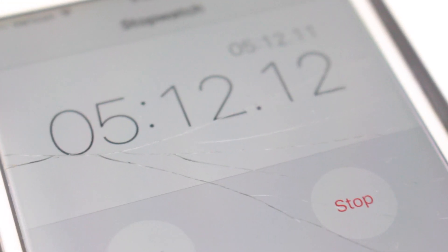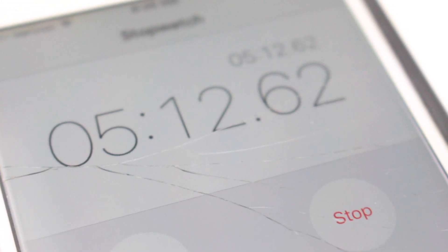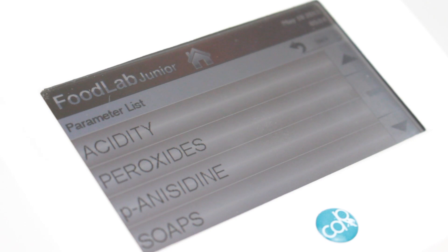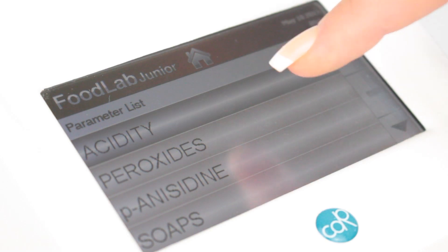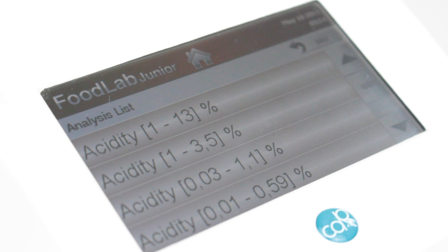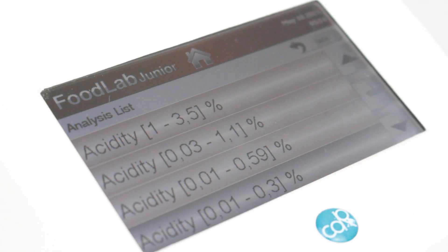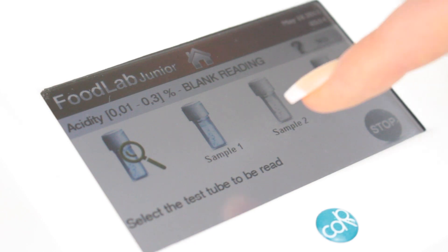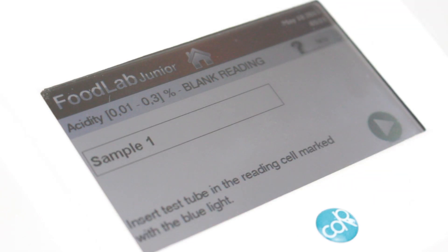Once the five minutes is completed and your reagent cuvettes are brought to the proper temperature, you are now ready to test. You'll begin by pressing 'Test' on the screen. Since we're testing for free fatty acids, you'll want to select 'Acidity.' From here you'll estimate which range your oil sample falls into.